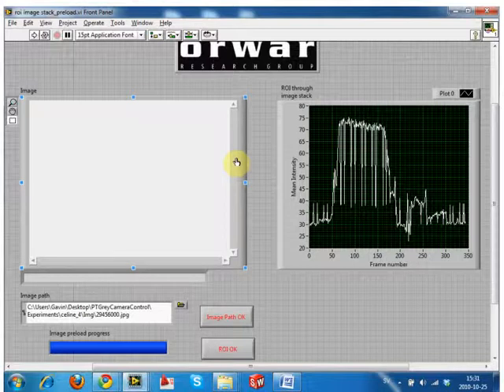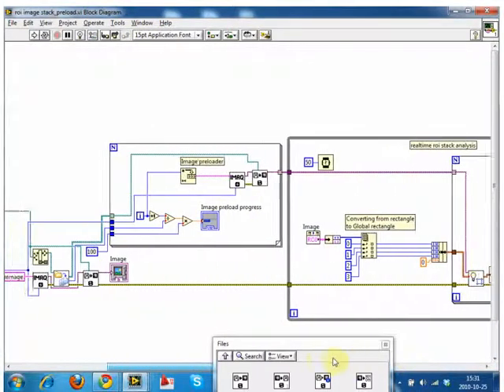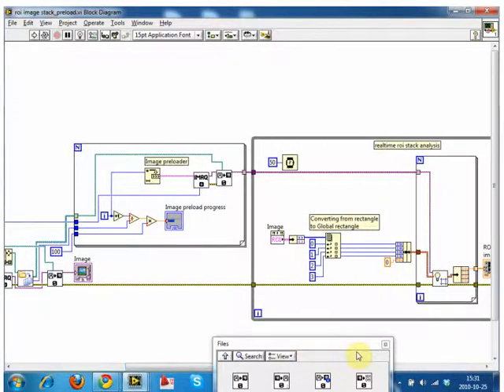But on the server, there's a description of what this is doing. If you actually compare the data, it's almost exactly the same structure. It's just actioned in a different order, just changing the way that the loops are done to do different things at different places. But there's very little difference between the two. So you can have a quick look, watch the video and see how they differ.